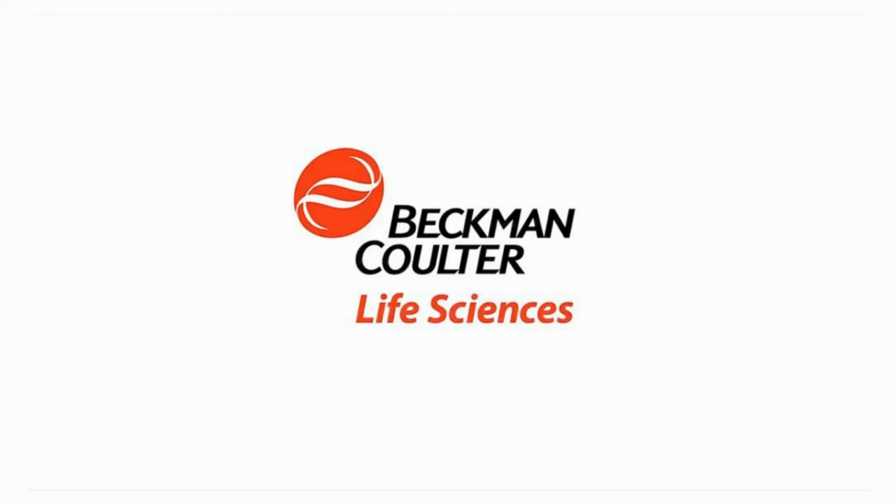Yeah, that's a good question. We have this islands of automation approach where you don't have to start at A and end at Z through this process. When we have antibodies, which is our workhorse platform, those would typically go through all the platforms that I discussed here. We also have a lot of work in other types of therapeutics, such as peptides and other types of VHHs. So we can jump onto these systems at different points. If someone is doing the molecular biology and the cloning in a different setup, we can jump on at the next phase of the process.